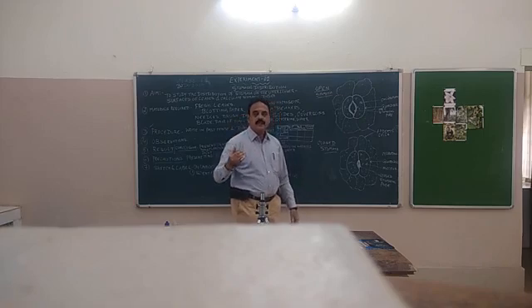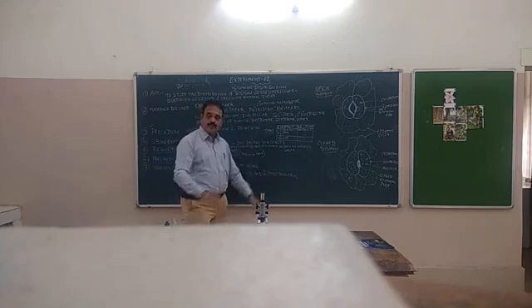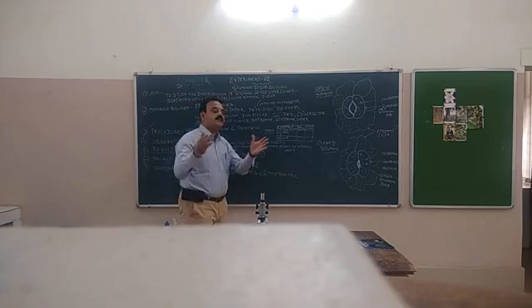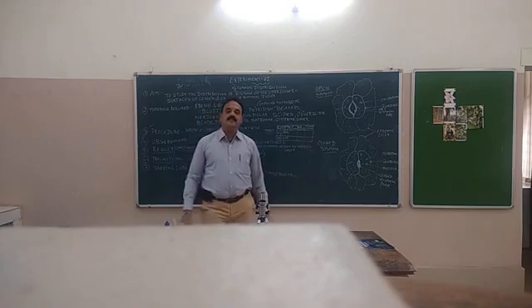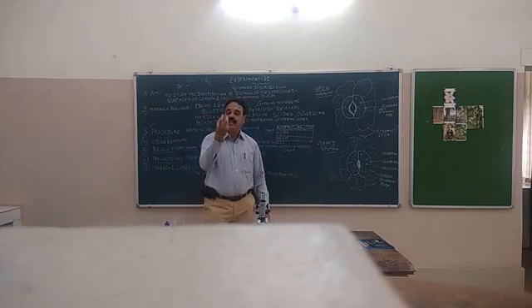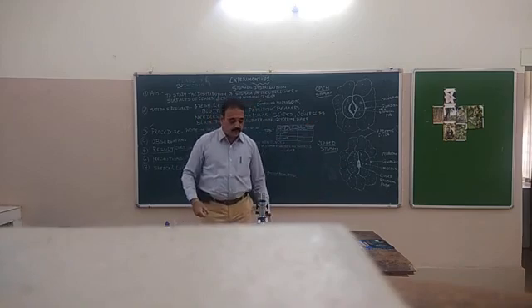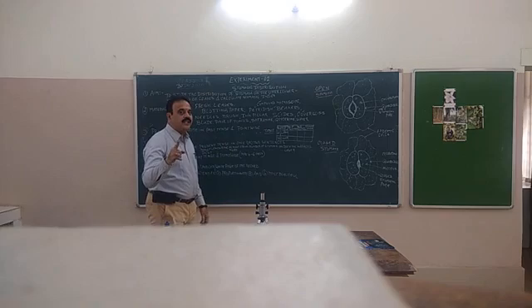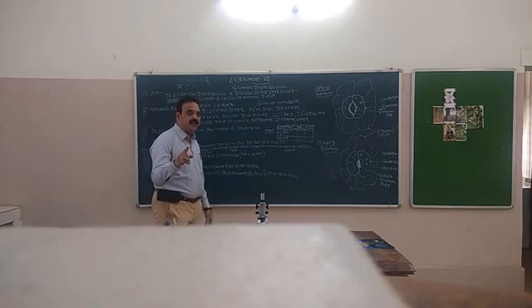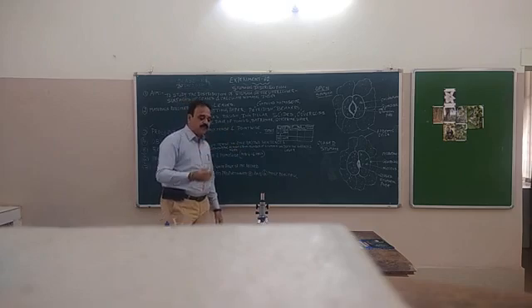And a bit higher, is there any ion or radical that decides opening and closing of the stomata? Is there any purpose in opening and closing the stomata? So these are the things we can ponder over while these cells are absorbing the coloring substance. All the questions I posed have answers, except I have not answered which matter, element or ion influences opening and closing of stomata. This is higher order thinking skills. Let me see who will answer that.